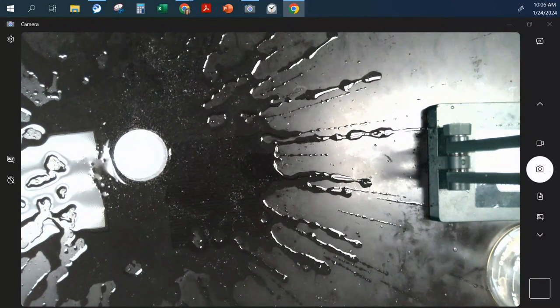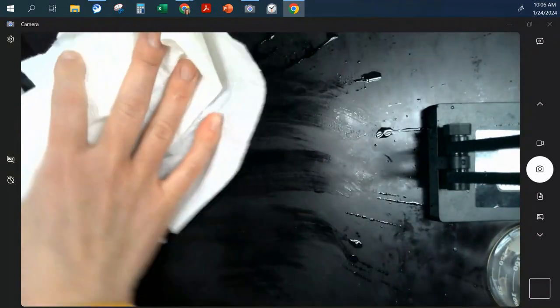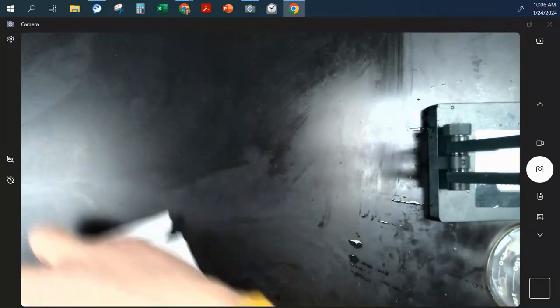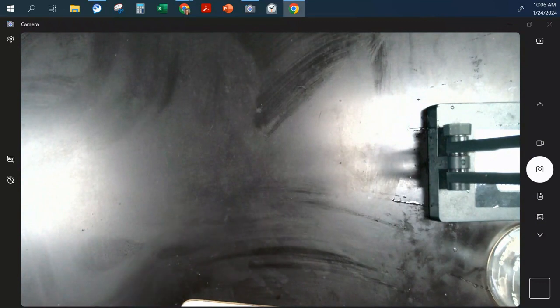Great, we got some paper towels. And this is just water and that Alka-Seltzer tablet, so we're good. Yes, all of these can go in the sink. If you have magnesium left over and it's still in the sink, you should fish that out. Okay, we don't want the magnesium to go down the sink. But we're using small amounts of everything, so most everything can go down the sink, I think.